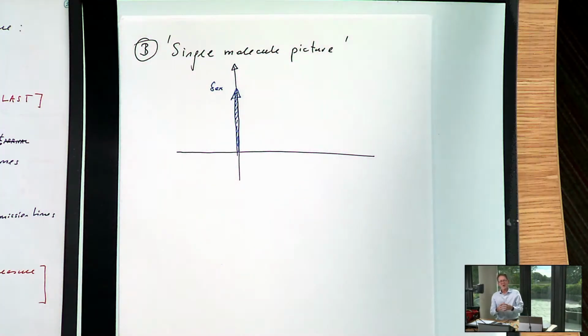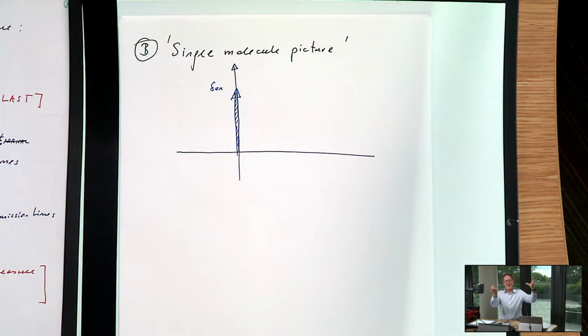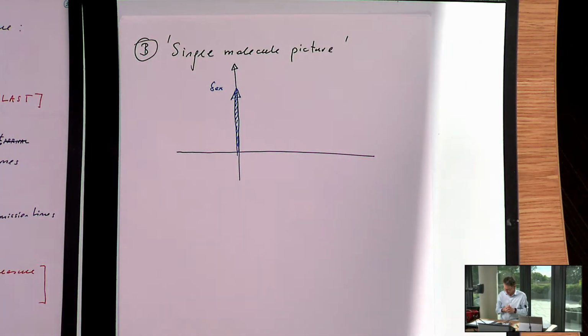What happens next? So a single molecule will be hit by photons from this delta function. They arrive and they hit it like I'm hitting a bell. And what happens next? Now the molecule can be excited into the upper state. It goes from state 1 to state 2. And then what? Well, there will be a photon coming back, a spontaneous emission. So at rate A21 it will be generated. It can be quenched down, of course, as we've seen as well. So for Alexa 488, that probability is about 10%. But there's a 90% likelihood that for the excited molecule you also get a photon coming out.